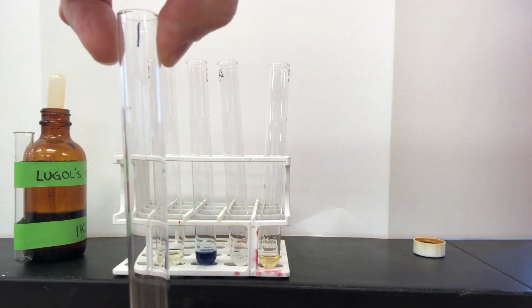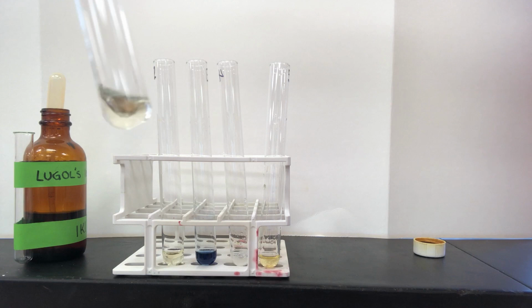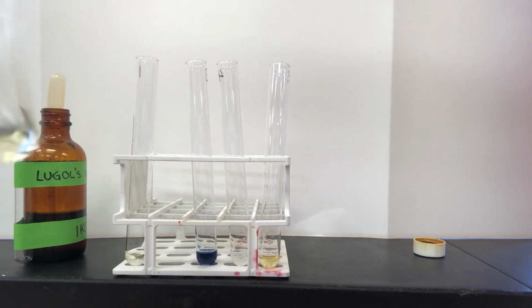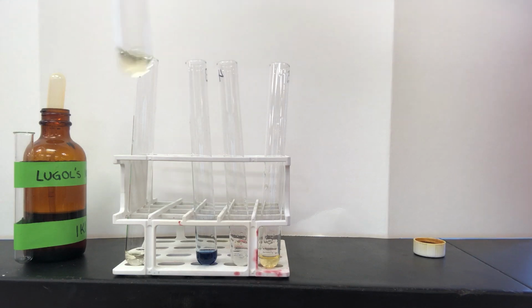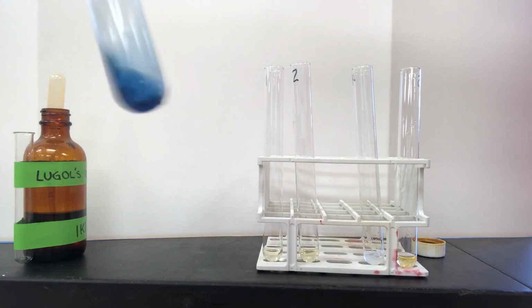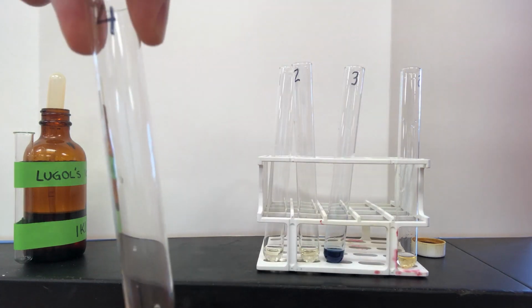Using test tube number 1 with water as your negative control, compare each sample with it to identify any change from the honey-colored solution seen in the negative control. You can see that the only sample that is changed is test tube number 3 with the starch. It's turned an inky blue-black.